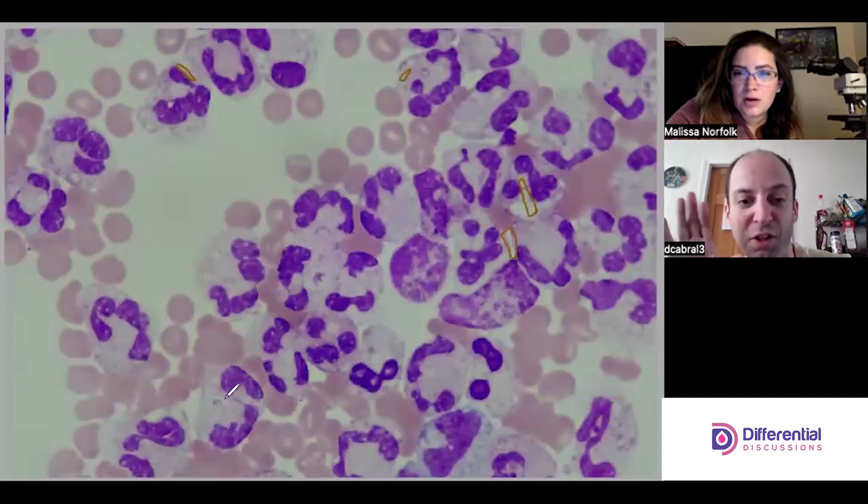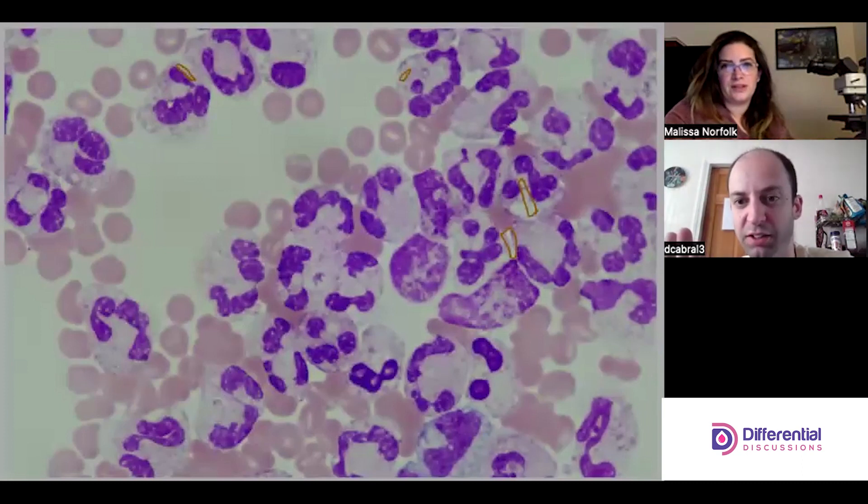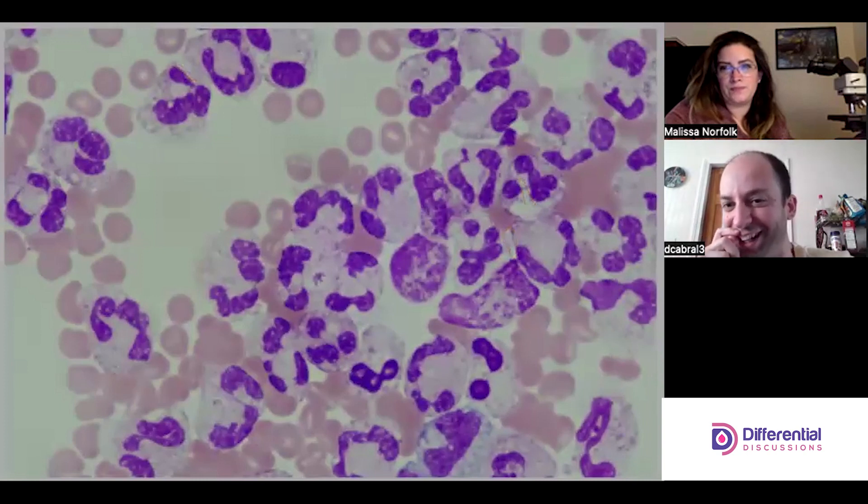For our viewers — look at those markings, and then we'll clear them. If we play with the fine focus you'll see them kind of refract in and out of focus.